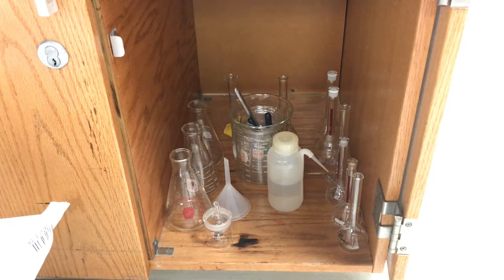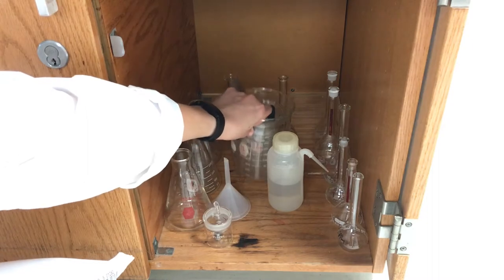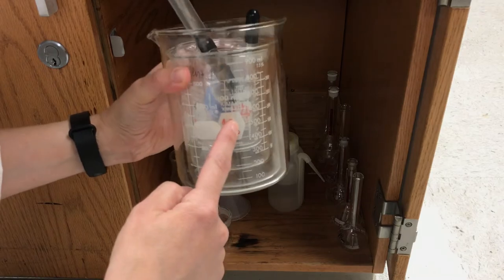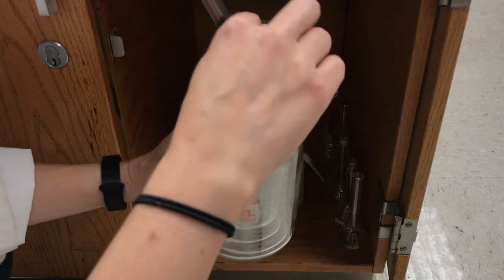So you will be given a checklist of items that you'll find in the cupboard. You're going to find a stack of beakers from 1,000 or 800 milliliters down to 100 milliliters.